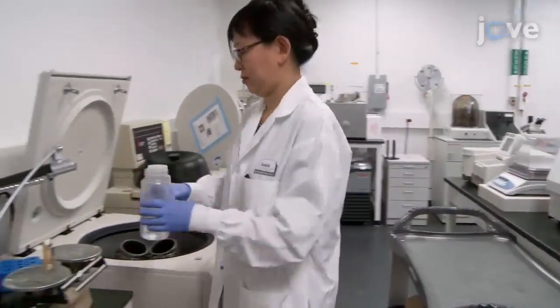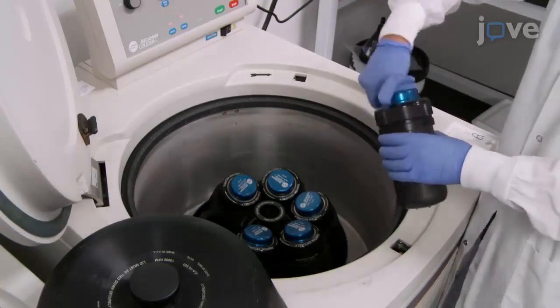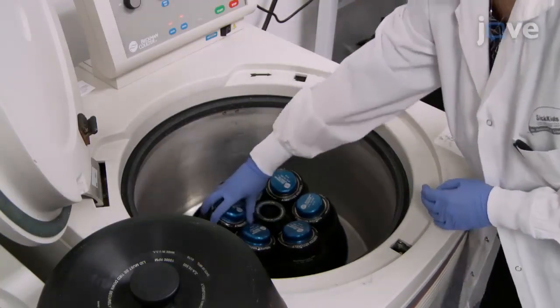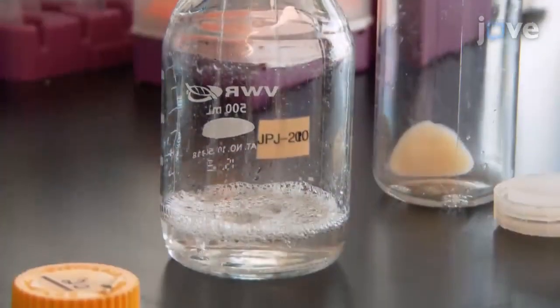To begin, prepare and transfect cells as outlined in the text protocol. Harvest the cells by centrifugation at 6,371 times G and 4 degrees Celsius for 20 minutes. Retain the supernatant, and then use a 0.22 micron filter to filter it.